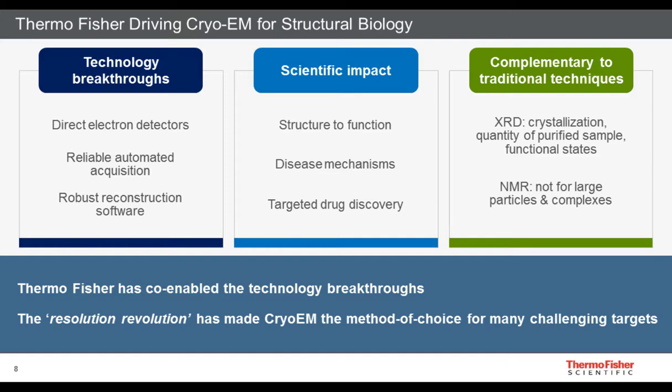Less and less manual interference is needed in this case, and development of specific software also plays a crucial role. And last but not least, of course, it's all about the reconstruction software. A lot of academic institutions have developed various software packages for reconstruction of single particle acquired data sets and turn them into 3D reconstructions. I think the subset of all these technology breakthroughs has made it possible to also create a scientific impact on the community. And I will also give a few examples of that.